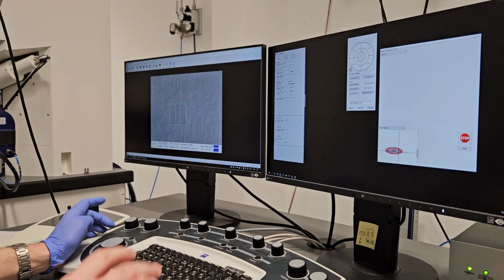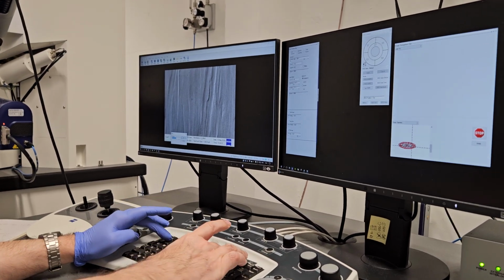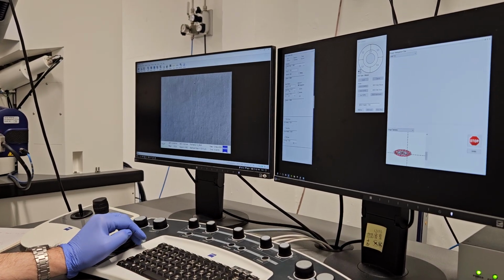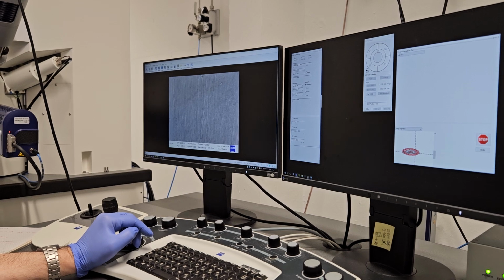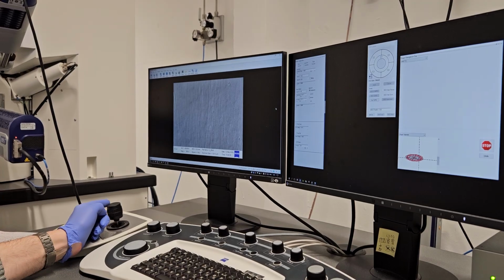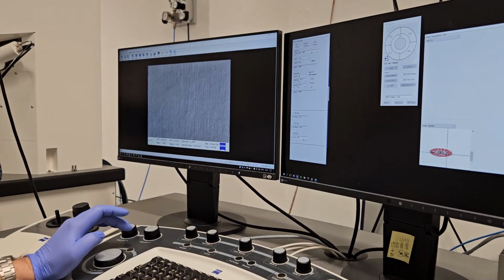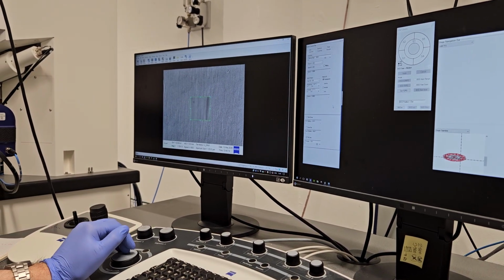If your sample is well polished, then you're lucky. So, I was given that sample. Not always. Okay, so the focus here should be okay.